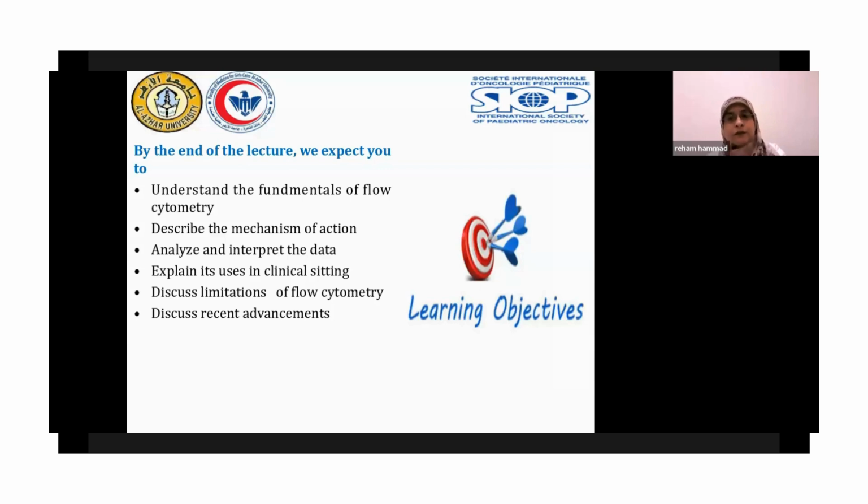Is it enough to depend on flow cytometry, or do the molecular people have their importance too? And I think they are so important in this setting. Then lastly, what are the recent advancements in the uses of flow cytometry?